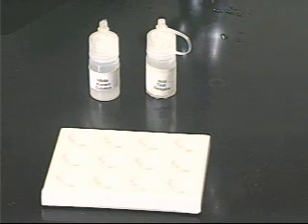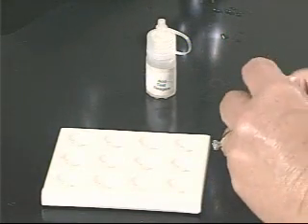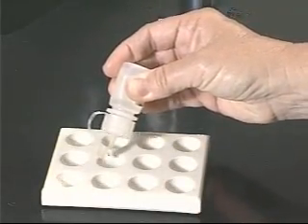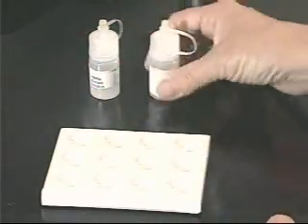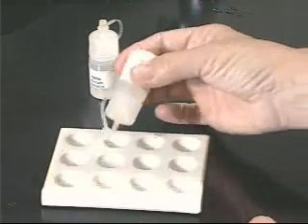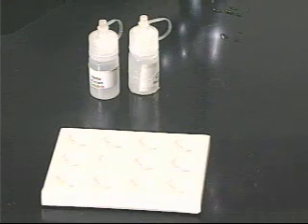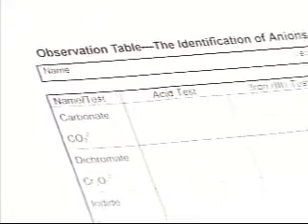This last example I'm going to show you is no observable change. I'll add the known anion and the test reagent necessary for the test. The reagents have all been added according to the procedure and, as far as I can tell, nothing has happened — there's no color change, no gas, no solid. Remember that this observation is as important as the others and should be recorded on the observation sheet as no change.